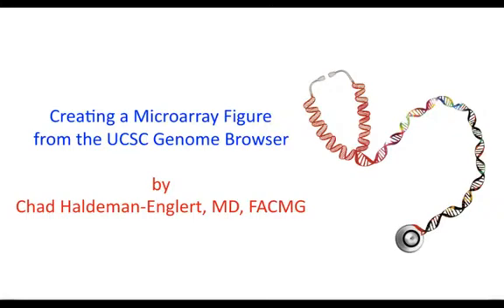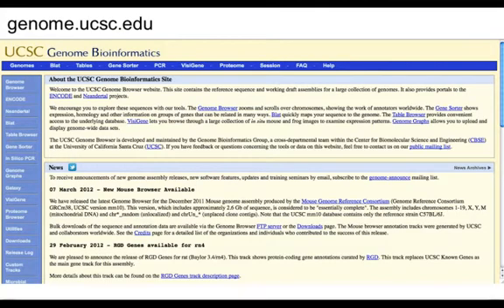Hi there. This is a short tutorial on how to create a microarray figure using the UCSC Genome Browser. You could use this in case you have a patient who has a microarray abnormality that you'd like to generate a figure for.